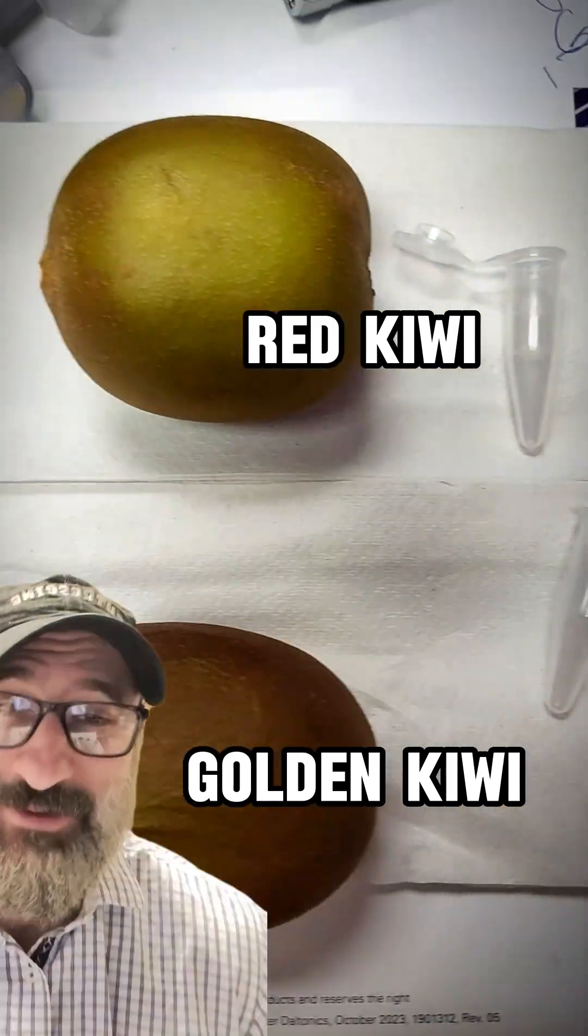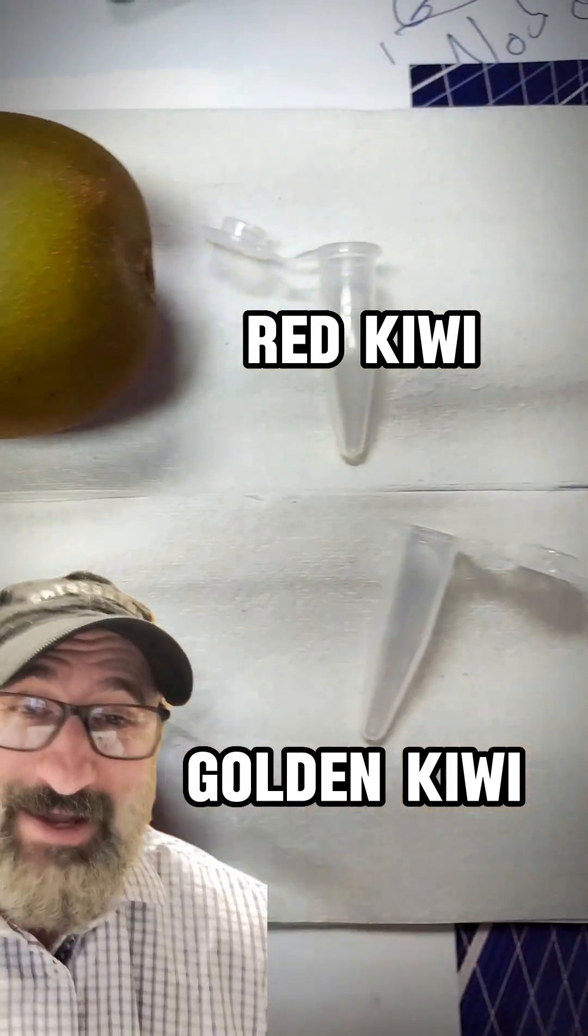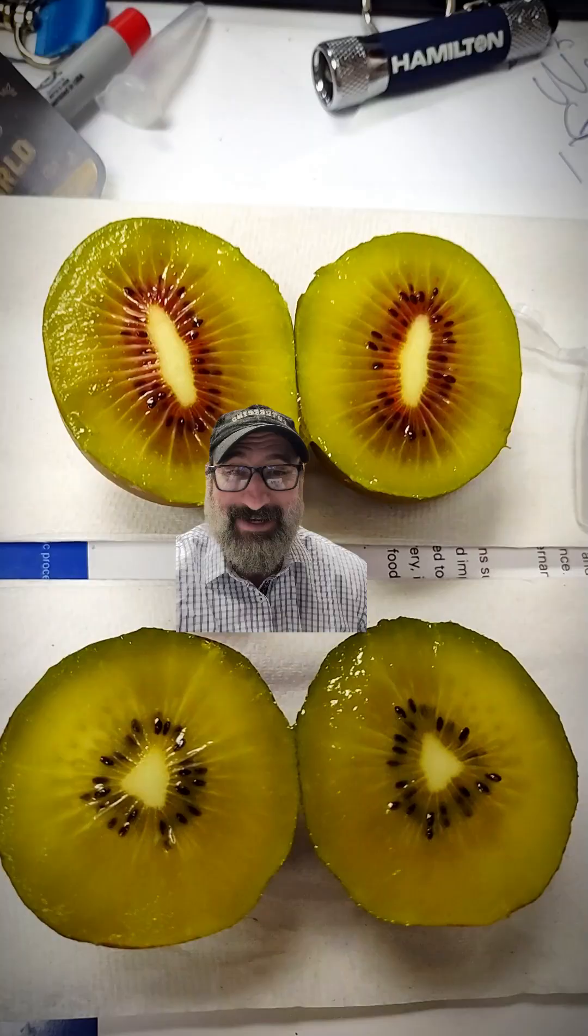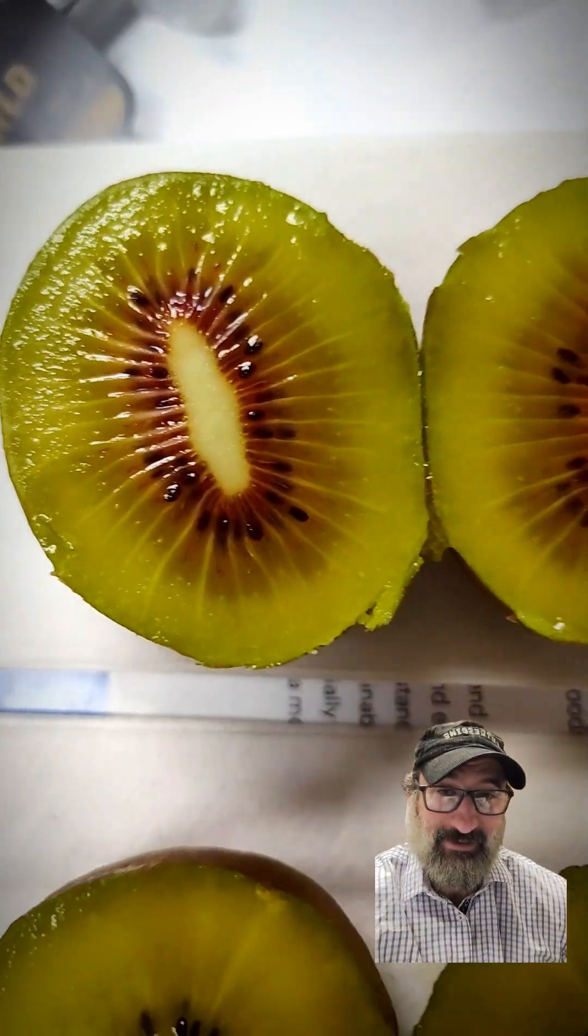All right, hope you guys find this one interesting. It's the red kiwi. I didn't know there was a red kiwi, and then there's a golden kiwi, and it seems like the red kiwi is like a variant of the golden kiwi.